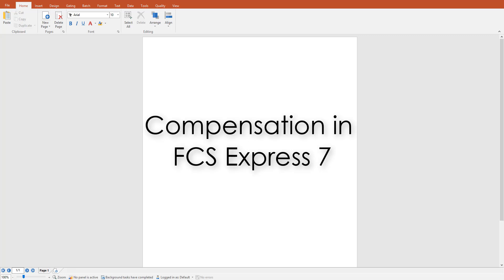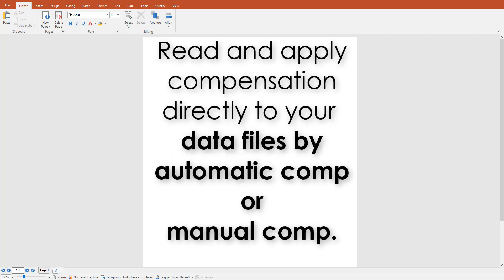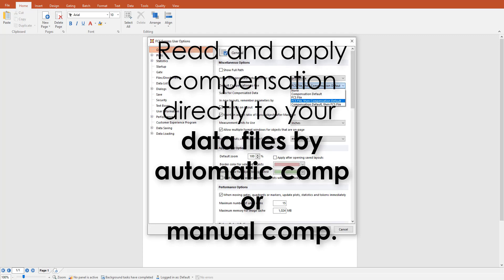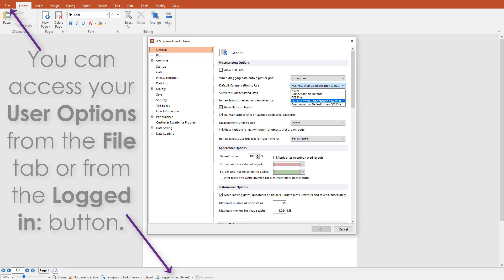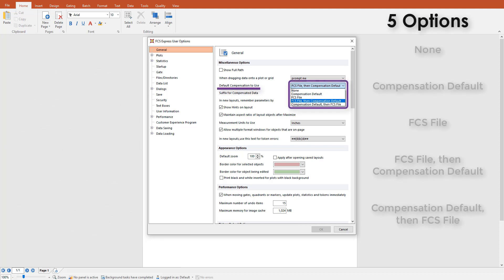In FCS Express, you can read compensation written at the time of acquisition and create new matrices manually or automatically with controls. Set your user option for the default behavior of how FCS Express reads and applies compensation in the layouts to best meet your needs.